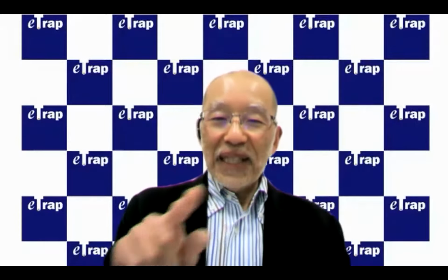Actually, I think that those doped materials give a different pattern depending on the kind of dopant and also the concentration. And it is not so straightforward. So actually, we can observe only the pattern shape, and there is no structural information. What does it mean? We need several or many different samples.